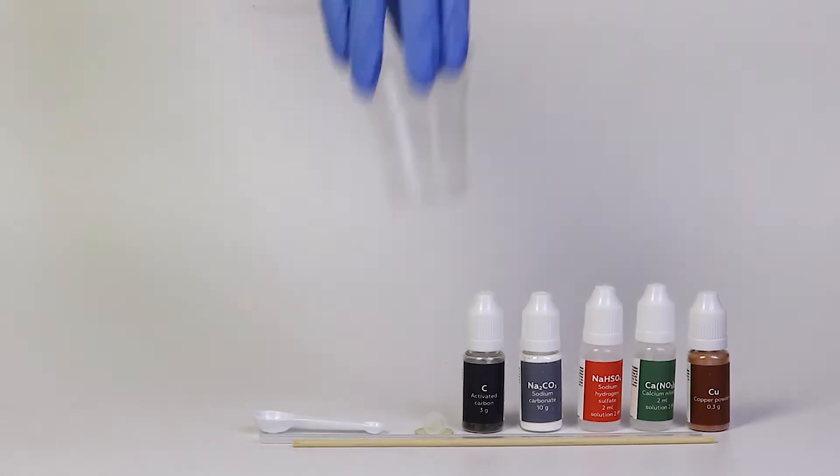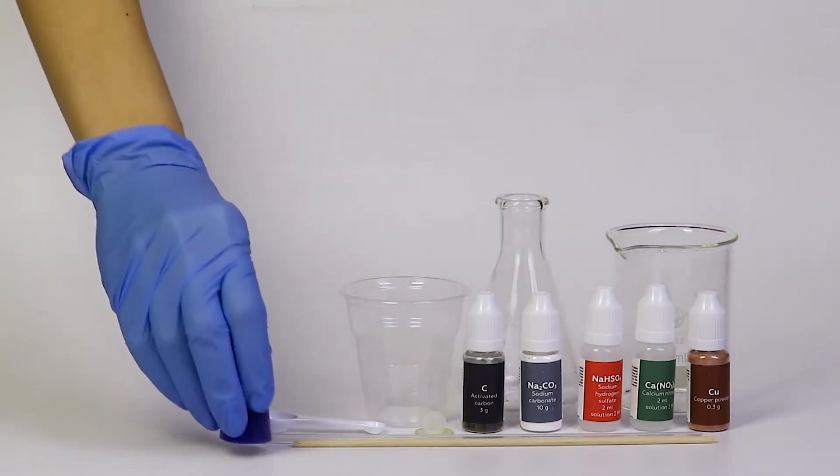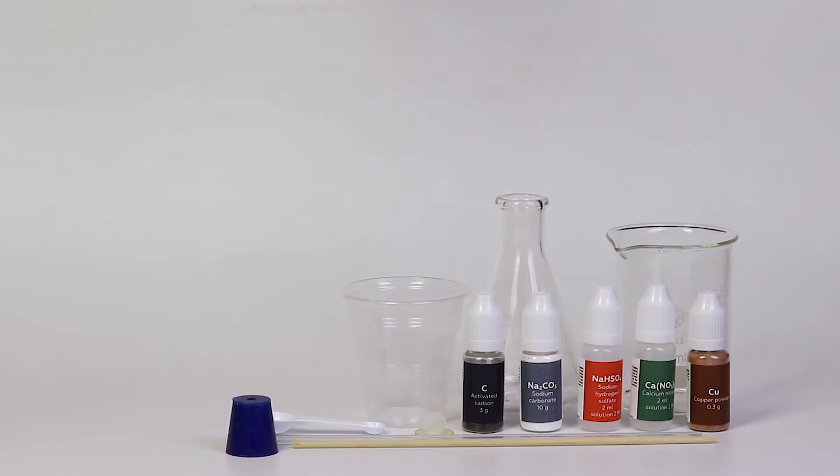From the starter kit, take a disposable cup, a beaker, a flask, a rubber stopper with one hole and another one without holes. Also, prepare boiling water.